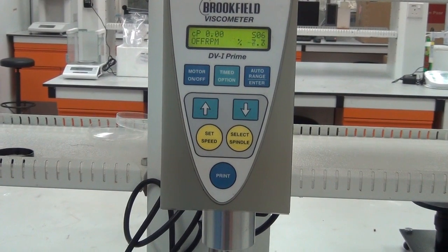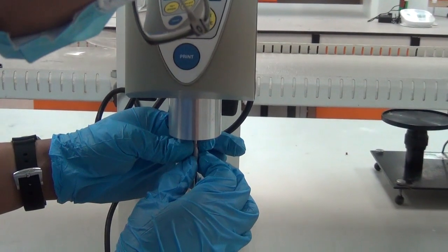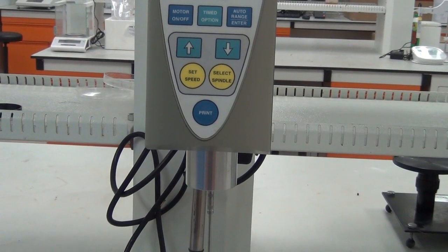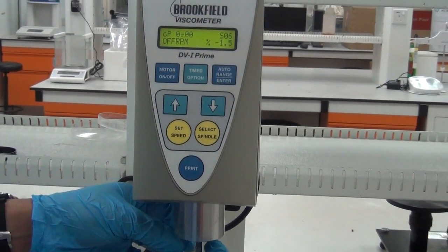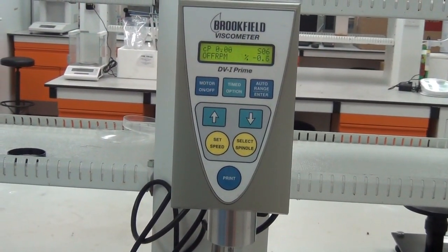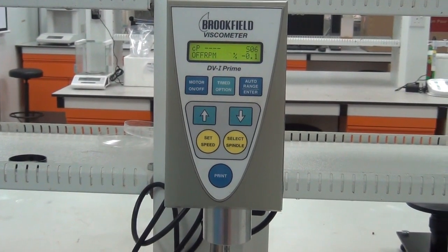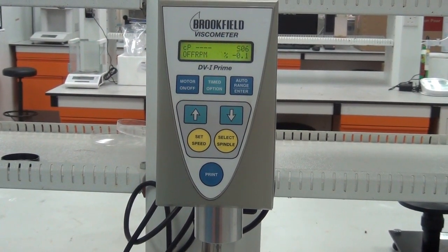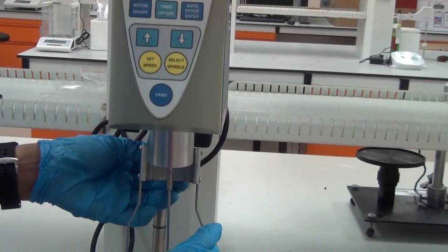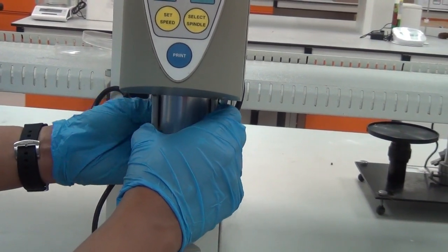If the error is bigger than 0.1, it means the spindle is not tight or there is an error with your spindle attachment, so make sure you put it correctly. Okay, showing minus 0.1%. Then this is the guard leg, which you put at the back of the spindle and attach together.